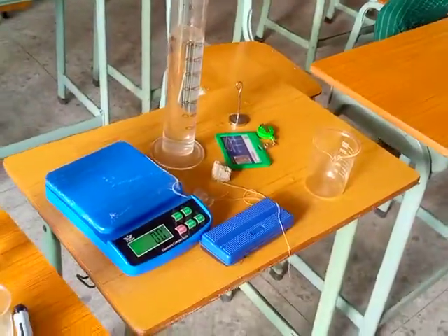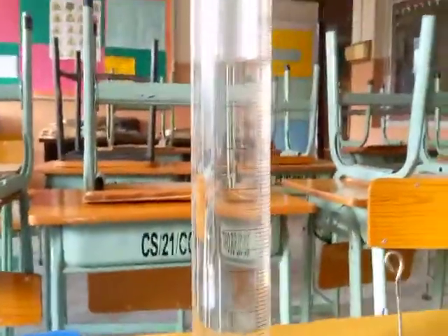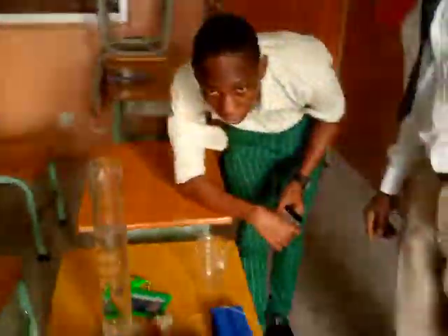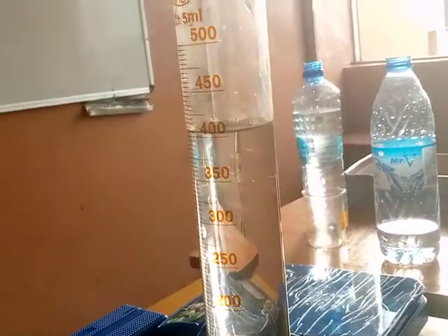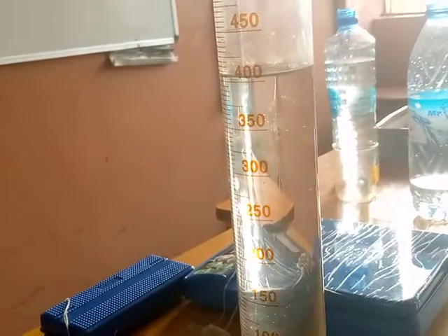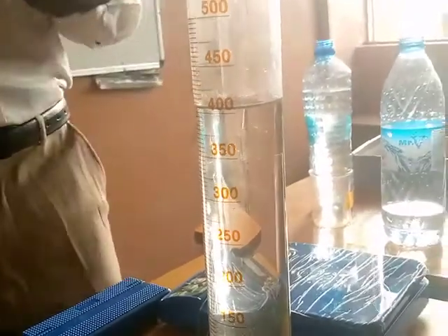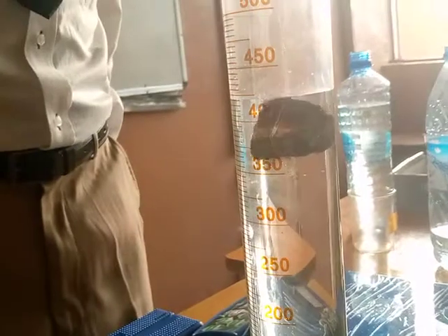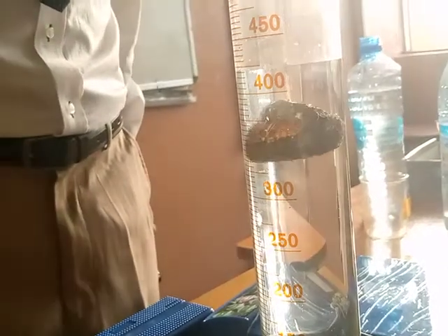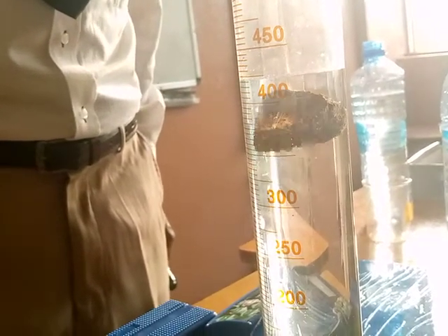So the first thing is, look at the volume of water inside this measuring cylinder. The volume of water inside the cylinder is 405 centimeter cube. Now, we will dip the stone, the piece of block, inside first, to get the volume of the stone. The final volume is 420 centimeter cube.